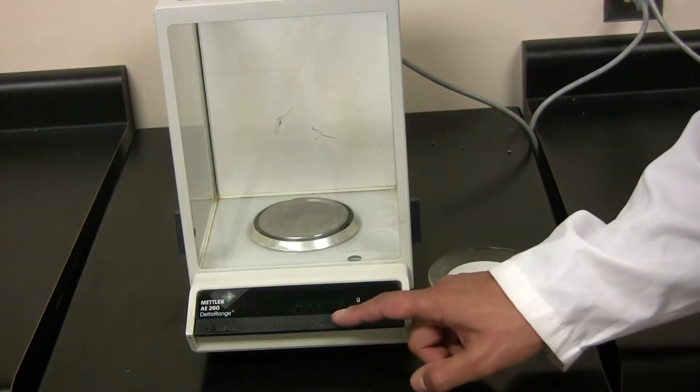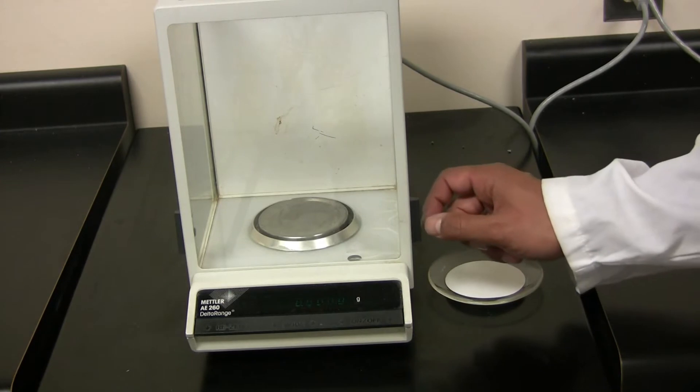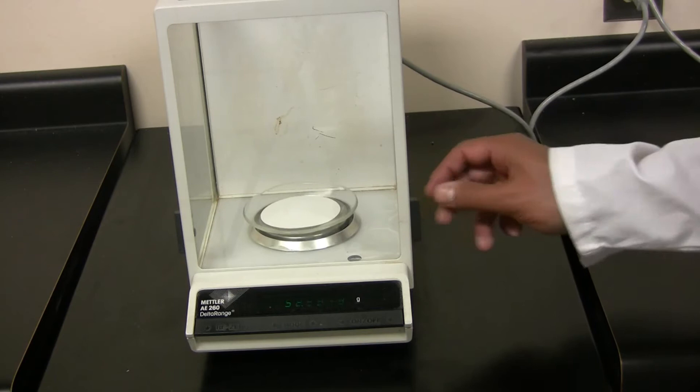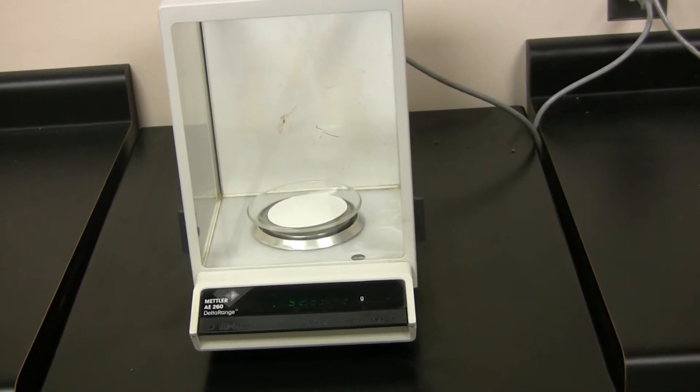Make sure to tare the analytical balance first. Open the door and place the watch glass and filter paper inside and close the door. You want to record this weight.